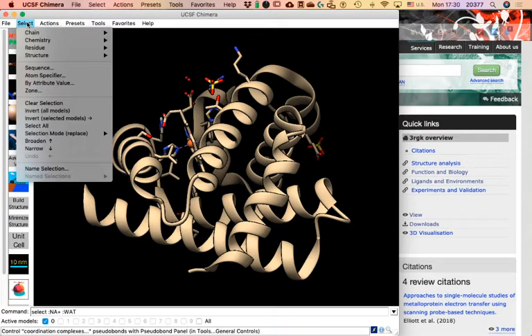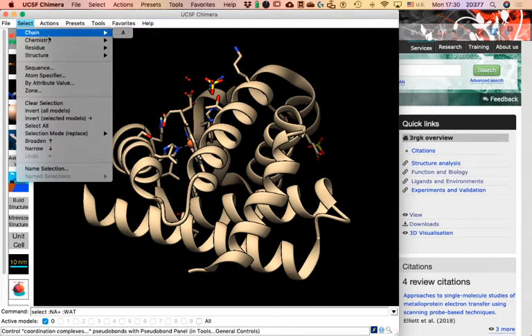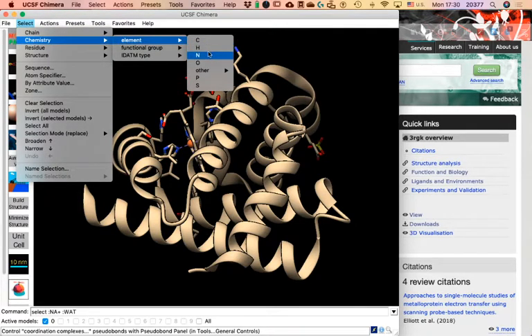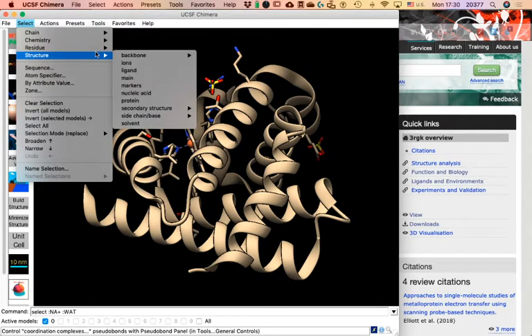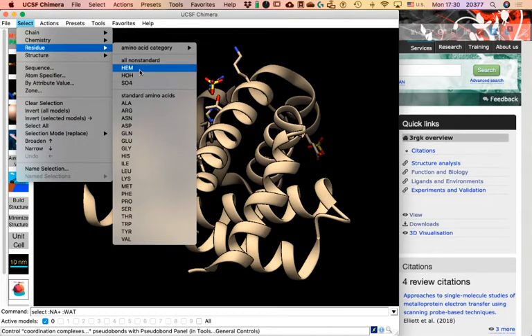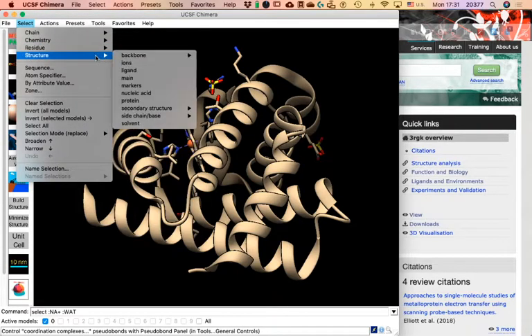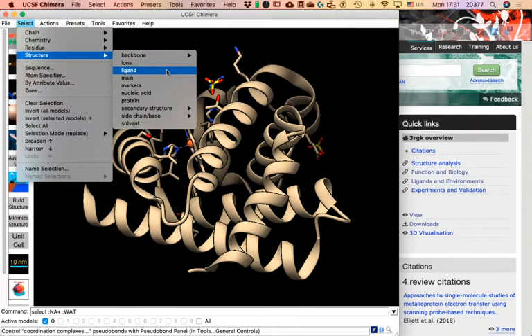The Selection menu does only selecting. You can select items in the structure through chemistry, functional groups, or type of atoms. If you select by Residue, you can select things that are not part of a protein — such as the heme group, water, and sulfate — or standard amino acids. Under Structure, you can find secondary structure, protein, nucleic acids, and ligands. For example, in this protein the heme group might be considered a ligand, as is the sulfate, so if I click Select > Structure > Ligand, I end up selecting the sulfates and the heme group.